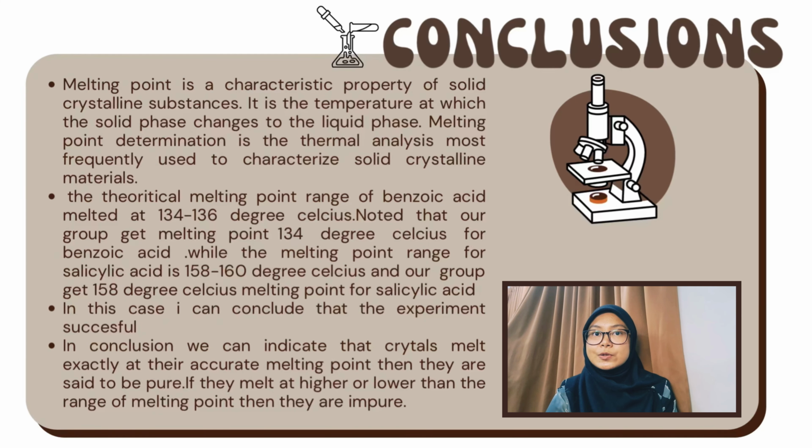Before I state the conclusion of the experiment, I would like to give the definition of melting point. Melting point is a characteristic property of a solid crystalline substance. It is the temperature at which the solid phase changes to the liquid phase. Melting point determination is the thermal analysis most frequently used to characterize solid crystalline material.